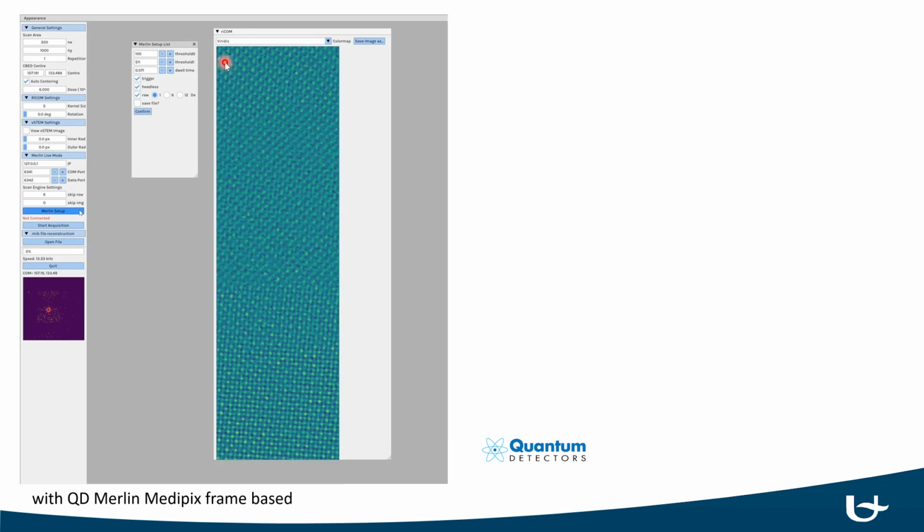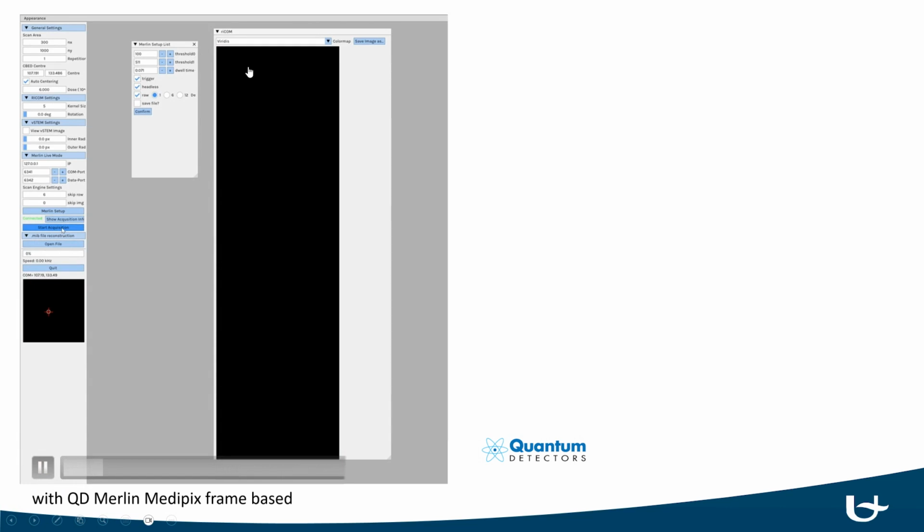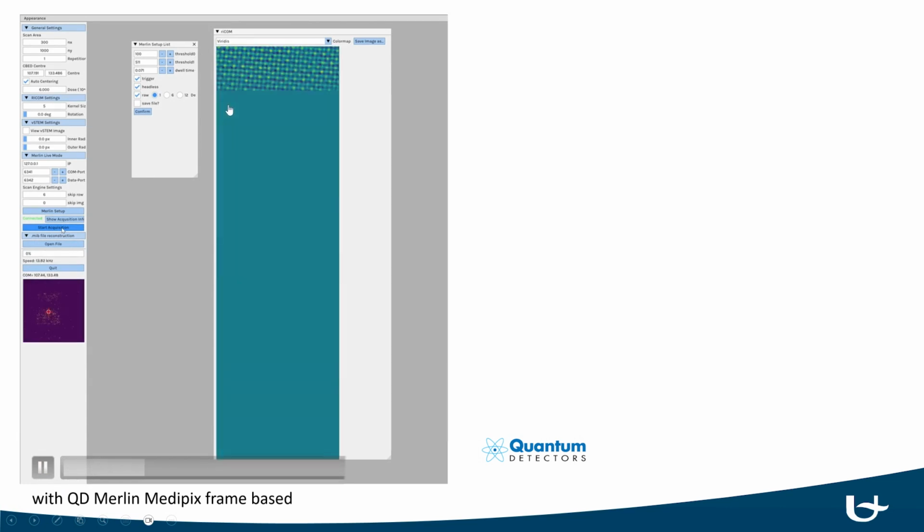But now in the background, there is a full set of 4D STEM data that is coming in. So here I show the results with the Quantum Detectors Merlin camera, which is a frame-based camera. And I have to switch off my pointer here, and then I can run it. So you will see, hopefully, how the image builds up. It takes a while to start, and now it starts building up.